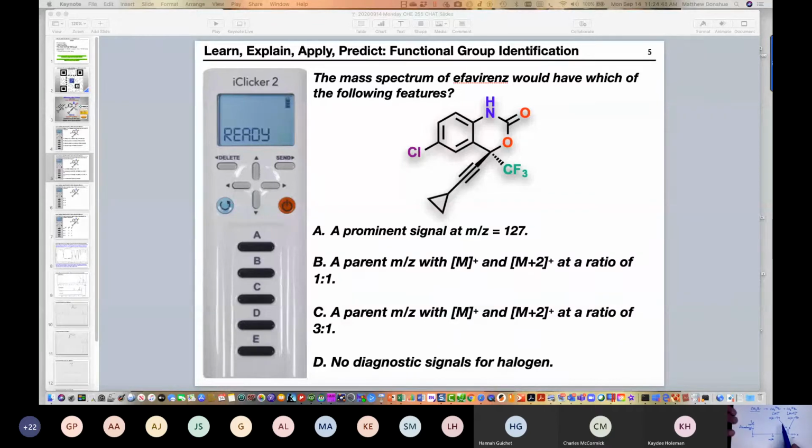Okay, so now let's get to the heart of what Mac was asking. What if you have multiple halogens? So I'm just going to take this and add two bromines now. CH2Br2. So now we have two bromines. What we have to consider is the possible scenarios for what those two bromines can be.